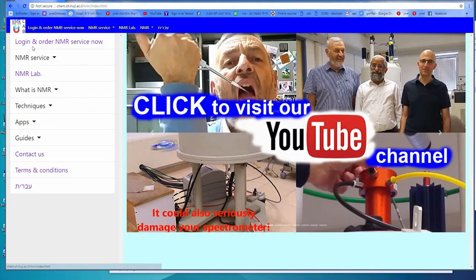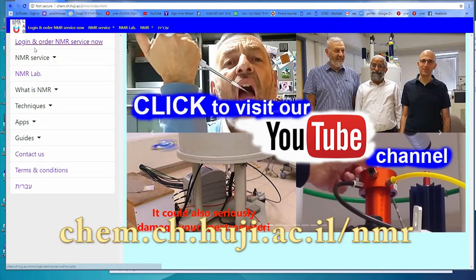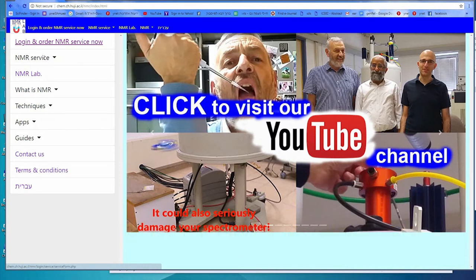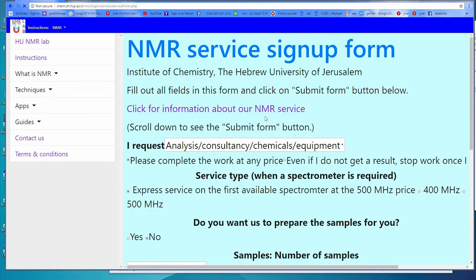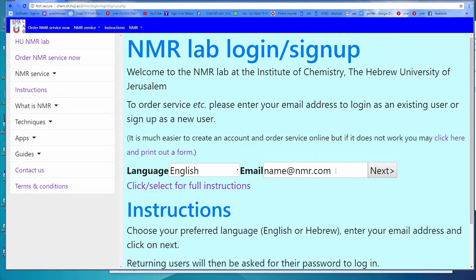Welcome to the Hebrew University NMR lab user login system. First, go to the NMR website at chem.ch.huji.ac.il/NMR. Click on 'Login and Order NMR Service Now.' You will be sent to a login signup page.